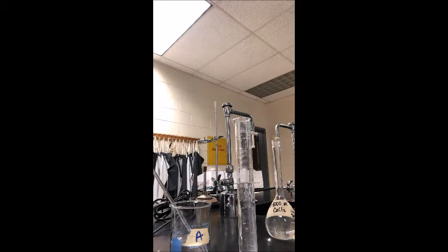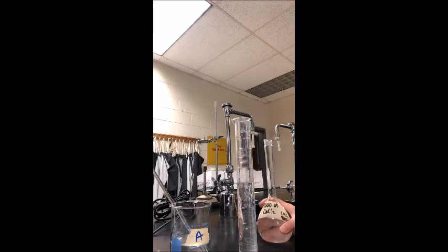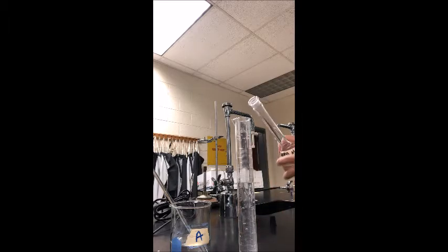Okay, it's slightly below, so at this point I'm just going to add a little bit more, being very careful to add it slowly so that I don't go over, a few drops. Let me check it again. It's still slightly below, so like 1 or 2 more drops should do it. And then I should be okay. Don't go too far over.